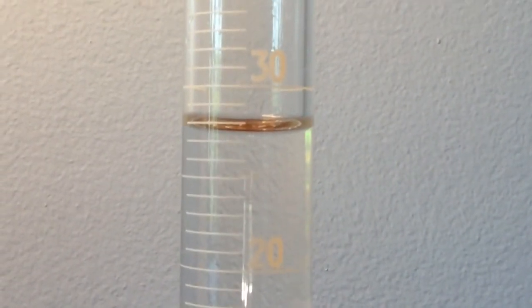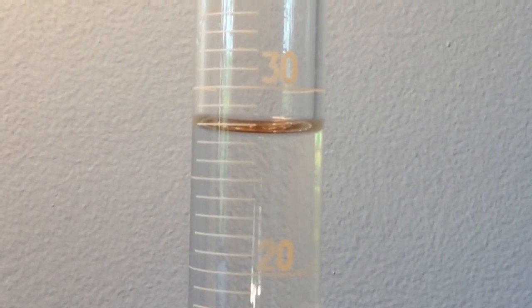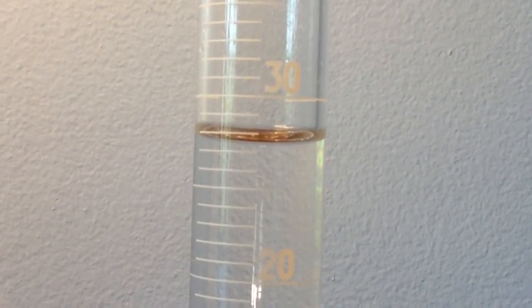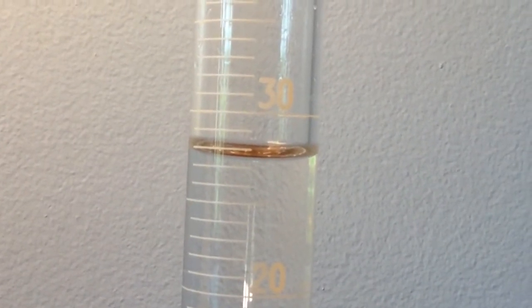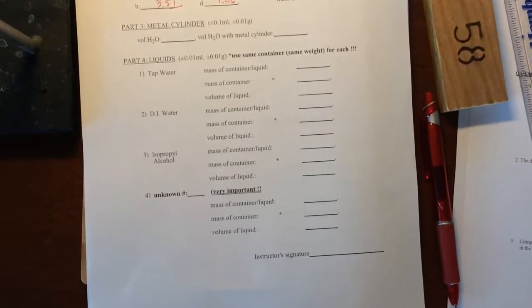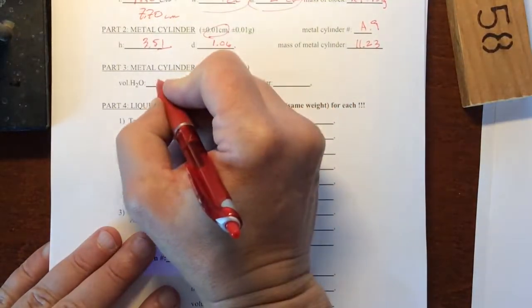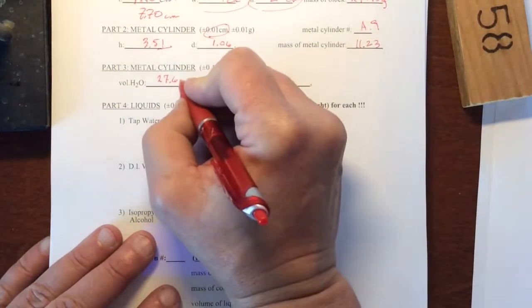The line that the 30 sits right above is 30 mils. The individual lines are 1 mil intervals. So we can either count down from the 30 or up from the 20. We'd see that as 25, 26, 27. Looks like a little more than 27.5, so maybe I'd call that 27.6. My original here is 27.6 mils.